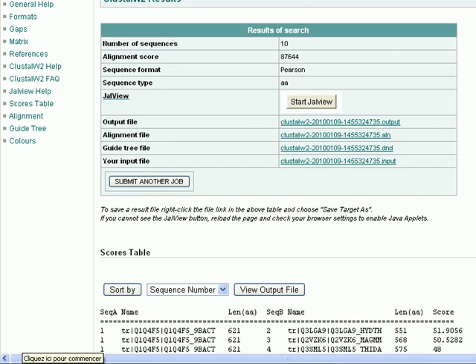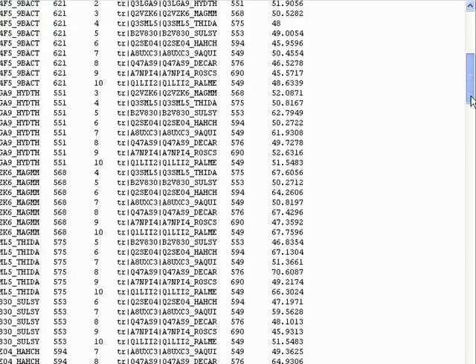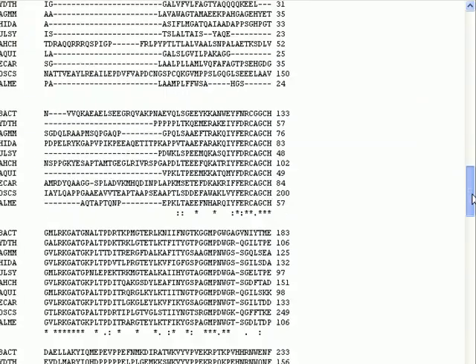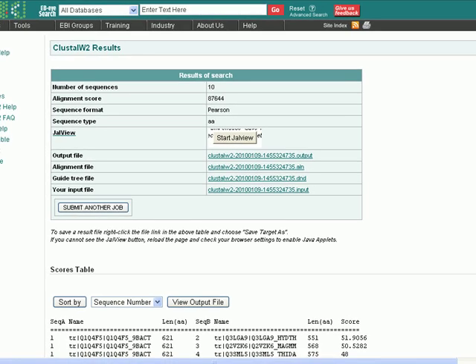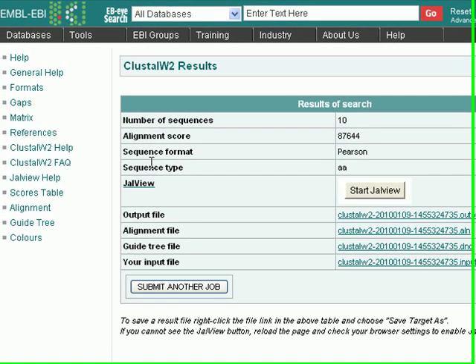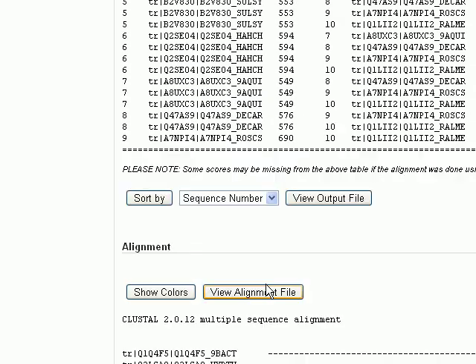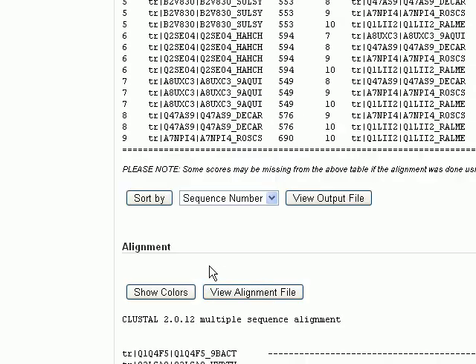Okay, this is our result page. We have a lot of useful information that we can use in our research. Here are the number of sequences, the alignment score, sequence format, etc. We can use the JalView software which is a very, very useful tool in multiple sequence alignments because we can edit our sequences. It has a lot of useful options.